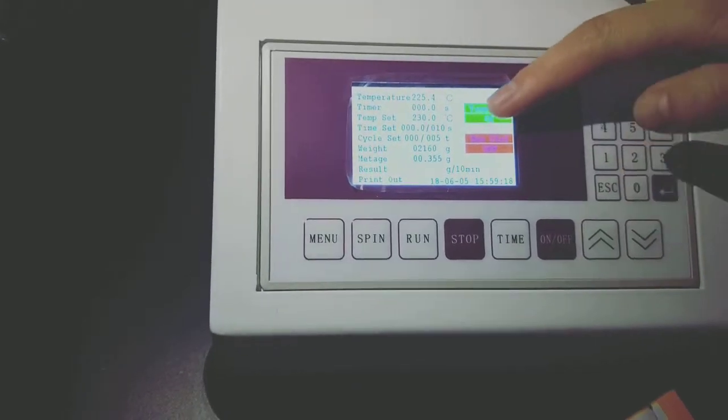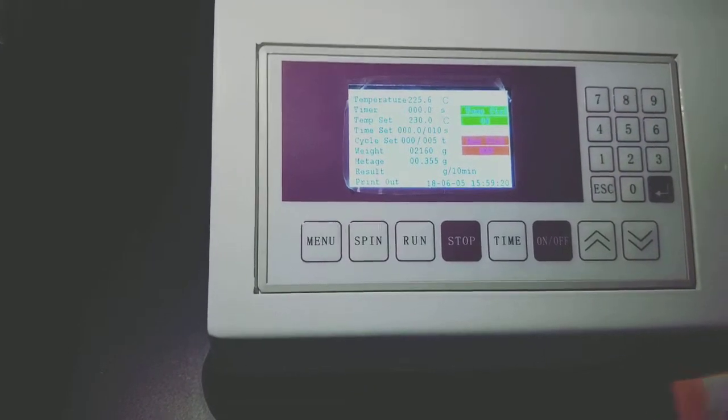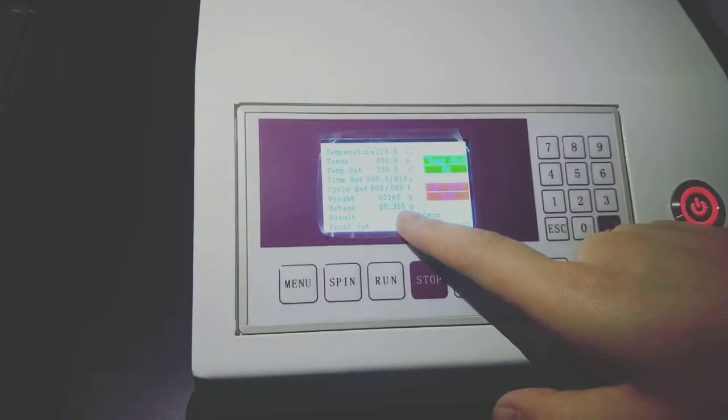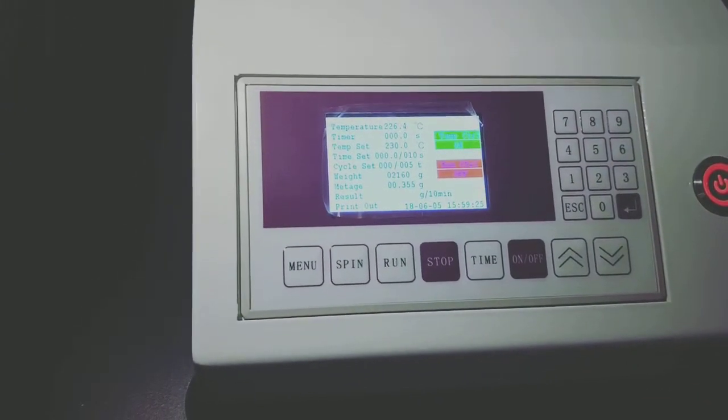We input the weight here and add the corresponding weights on the machine. And this metric is the extrusion sample weight.